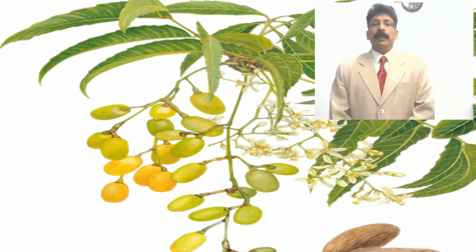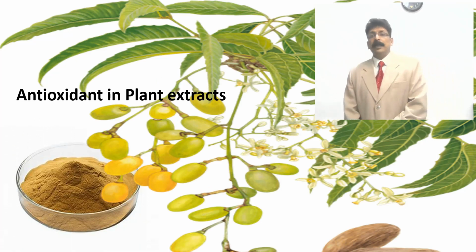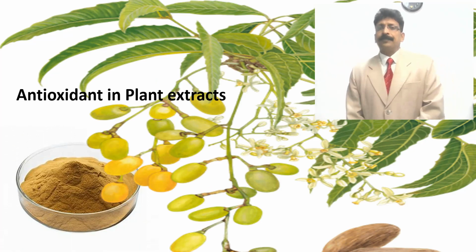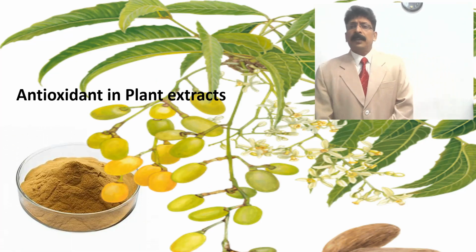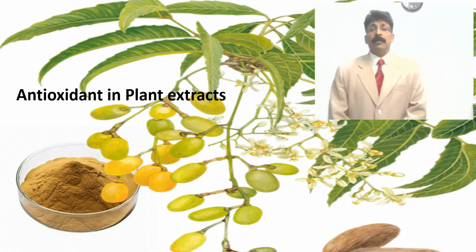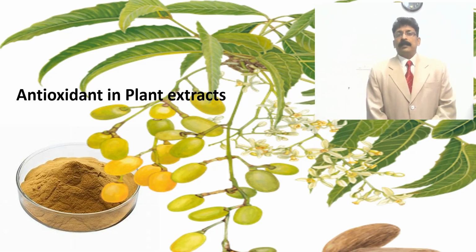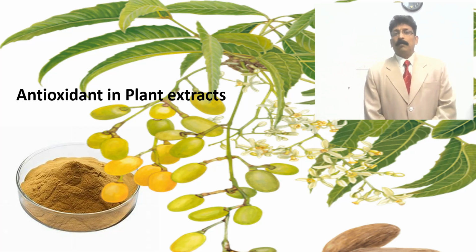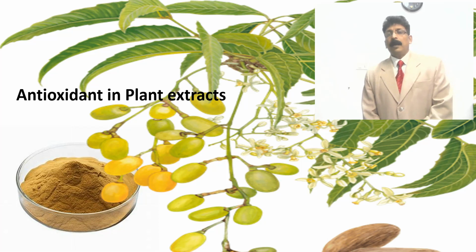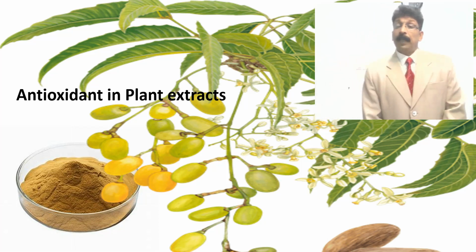Today we are going to discuss the antioxidant activity in plant extracts. We have taken an ethanolic extract from Melia dubia, that is Malabar Vembu, also called Malavembu.